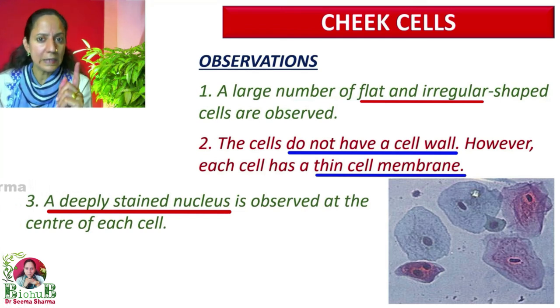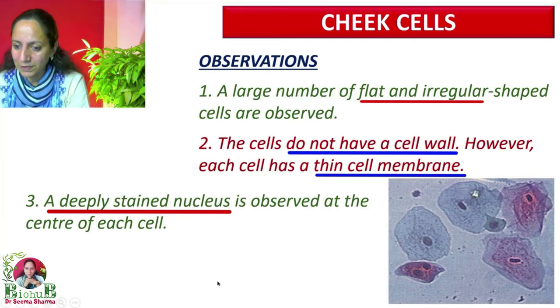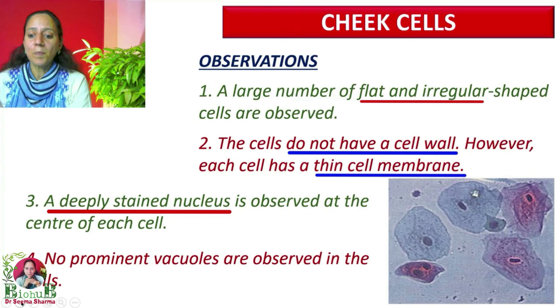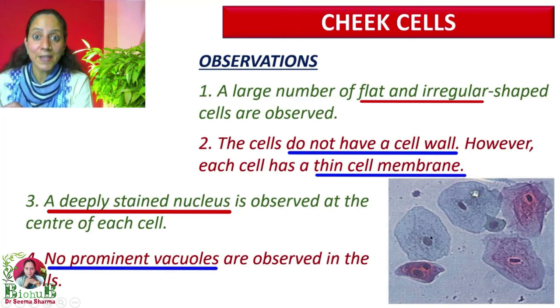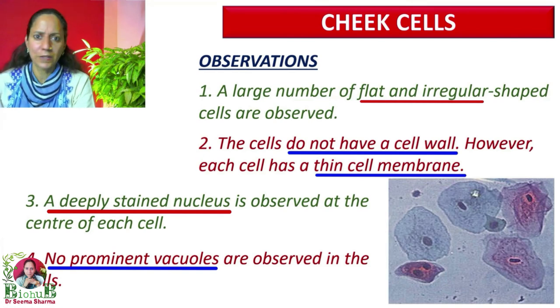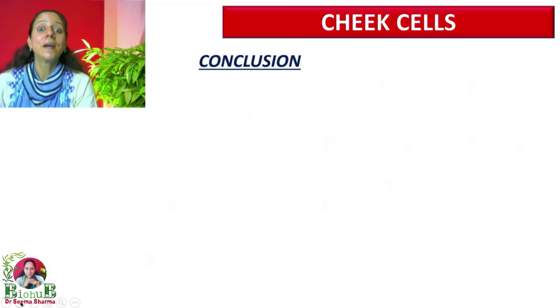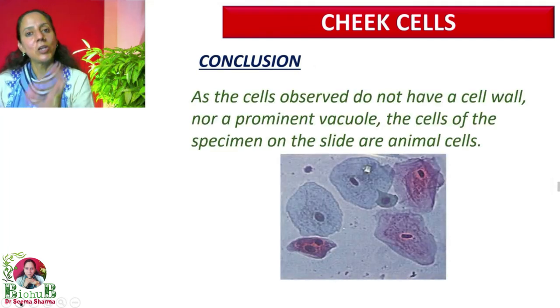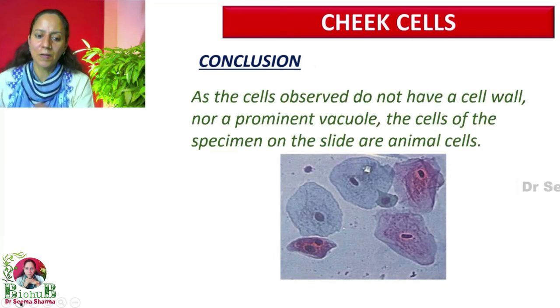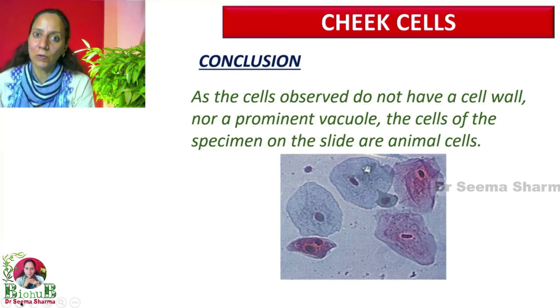A deeply stained nucleus is observed somewhere near the center — not exactly at the center but near the center — of each cell, and it is visible in all the cheek cells. No prominent vacuoles are observed. Since this is an animal cell, vacuoles are either very few or absent. We can conclude: animal cells have a thin outer covering called cell membrane, nucleus is present near the center, and there is no cell wall or large vacuole structures.